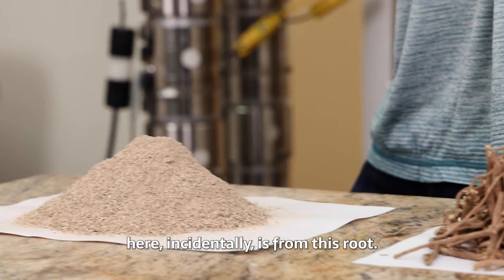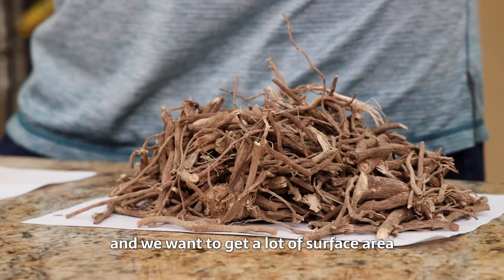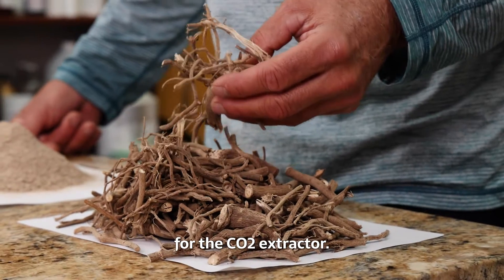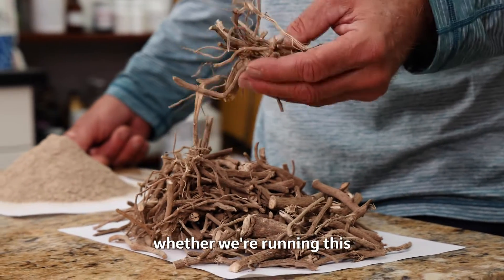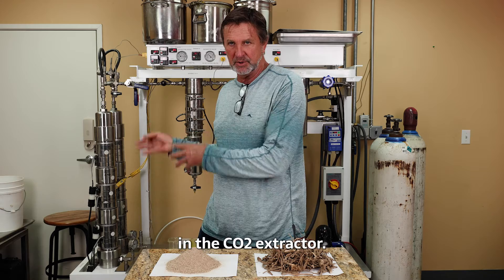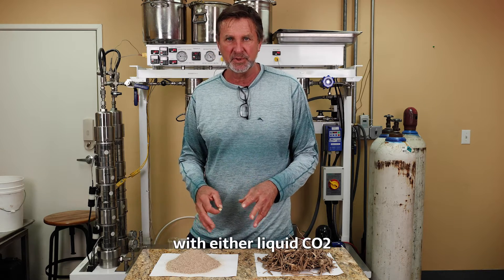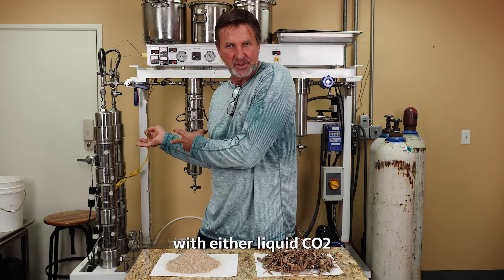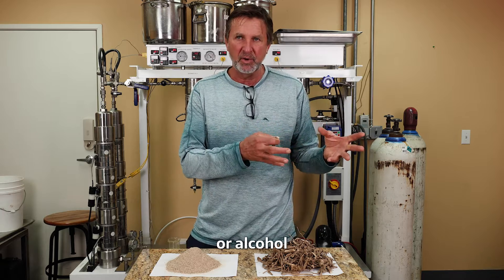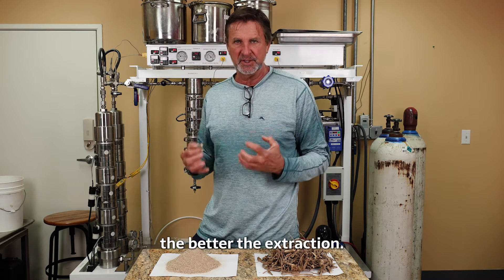This grind right here is from this root. So we take this root and we want to get a lot of surface area for the CO2 extractor. It doesn't matter whether we're running this in an alcohol extraction or in the CO2 extractor — we want the root ground up because we want as much surface area making contact with either liquid CO2 or alcohol. The more surface area, the better the extraction.